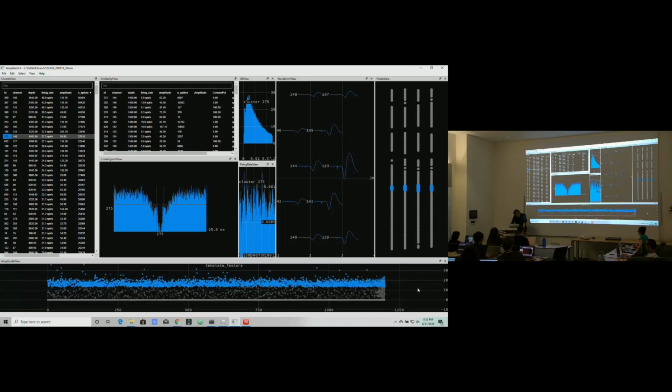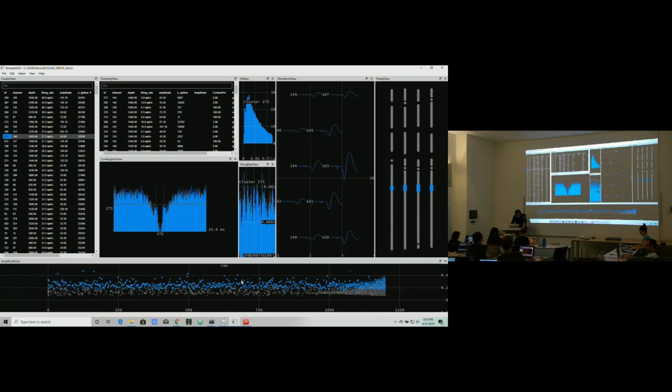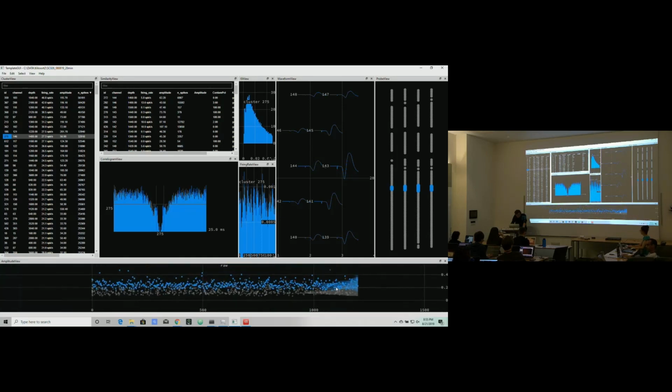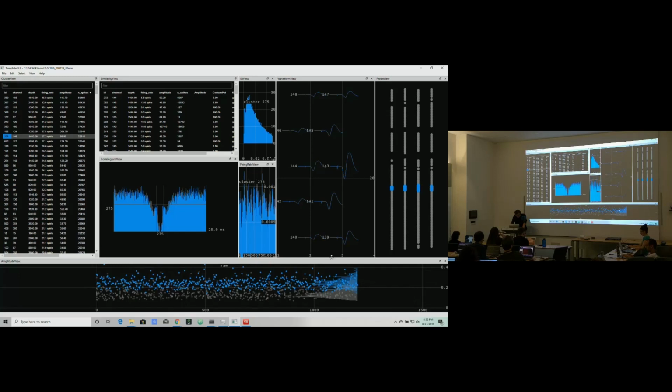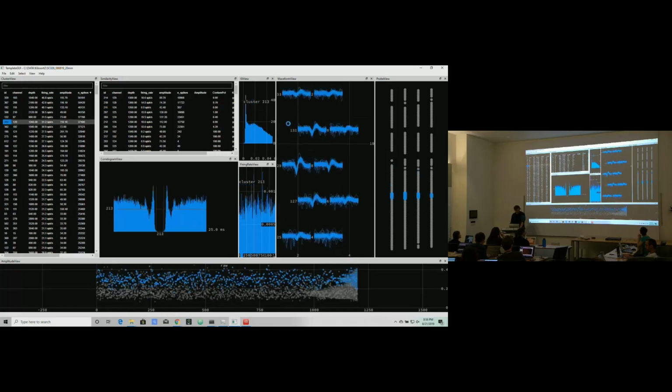I think I only have 2 things. Yeah, 3, there's feature. Oh, there's feature, so that's the feature, but there's template feature. Well, he added that since I looked at it. Okay, there's feature and template. It's in the documentation somewhere. I was interested. Oh, that's small. But this doesn't look like a 200 microvolt amplitude. It's a little noisy. I have not double checked to make sure. This is not 200 microvolts. Maybe something like this. No. This one maybe.